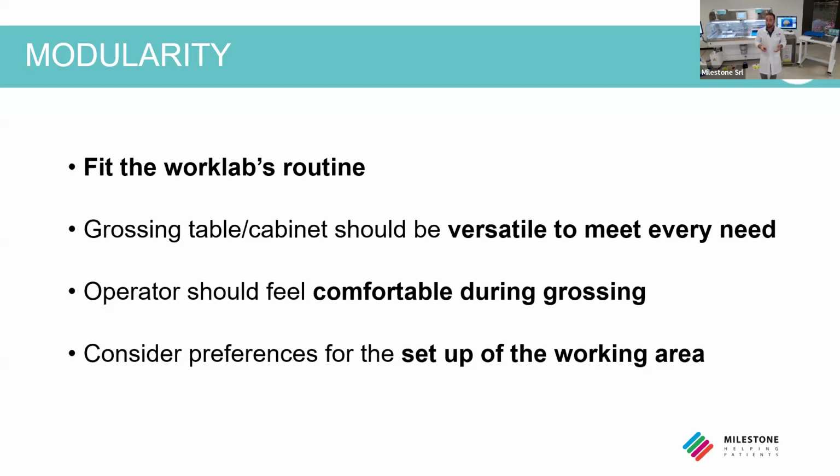Then the operator should be comfortable, of course, during the grossing activities. And then you have to consider all the preferences, so what's the intended design for the grossing station that you're going to buy.